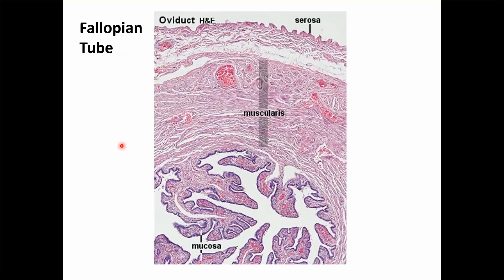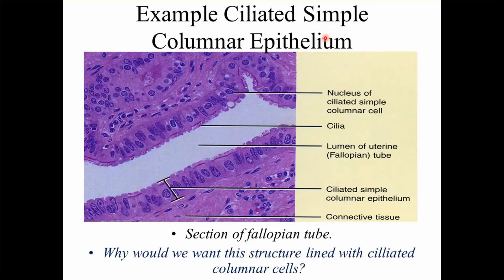Next coming to fallopian tube. The epithelium is simple columnar epithelium with cilia — it is functional because it helps in moving the ovum towards the uterus. There is a muscle layer and it is covered with peritoneum, so it is called serosa. You can see the ciliated simple columnar epithelium with the cilia, and the lumen.